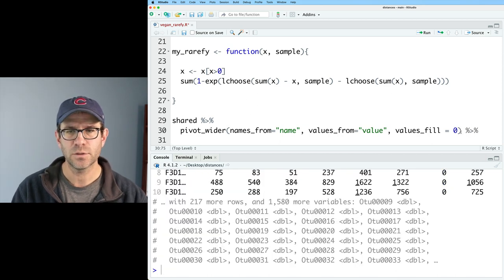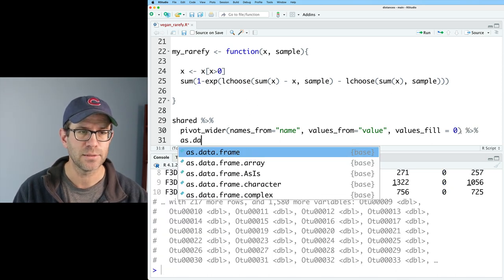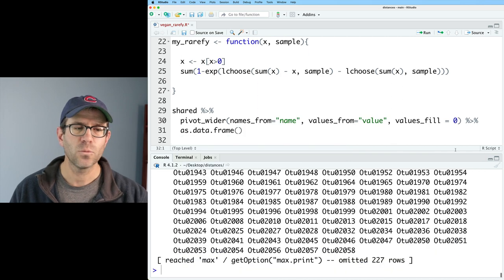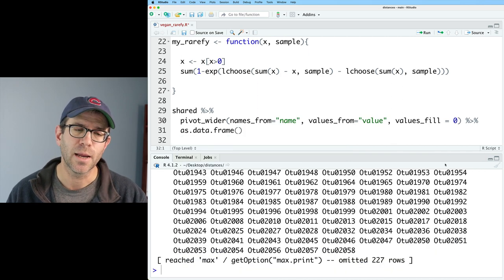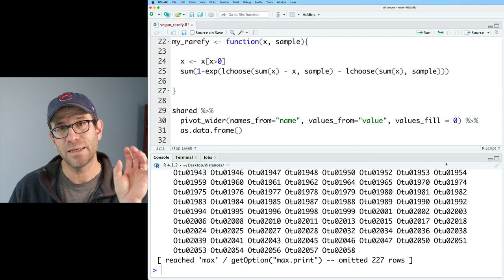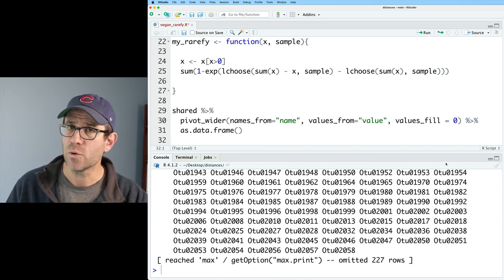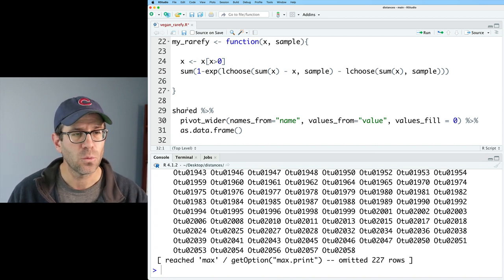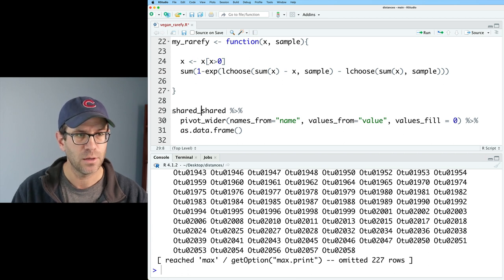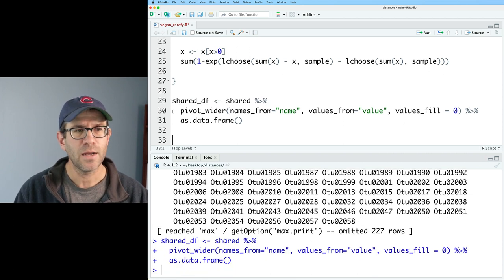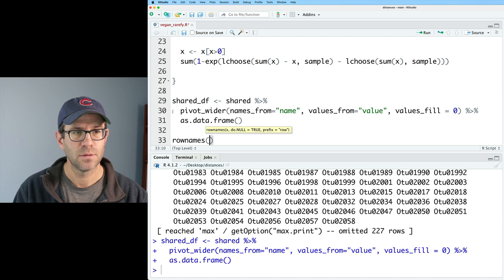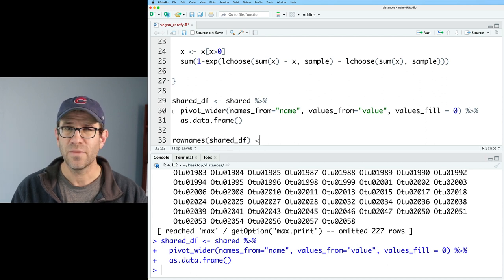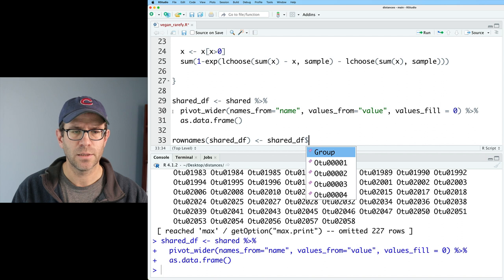And so again, what we see is that we then get this wide data frame. So I'm going to convert this into a data frame. So as.data.frame. And the reason I need to convert it to a data frame is because I need to put my samples, my groups as the row names. Tibbles do not allow row names. And so what I can then call this will be shared_df. And then I can say rownames, shared_df.